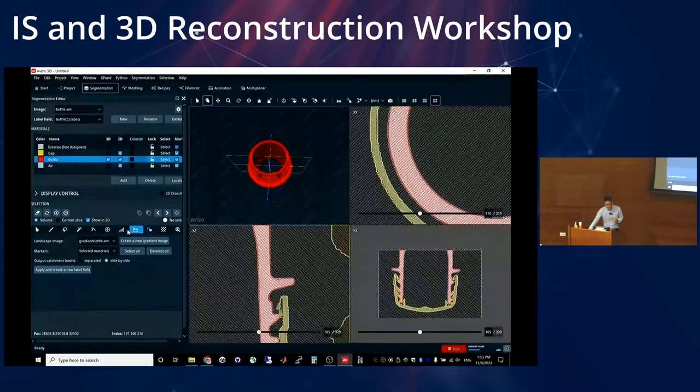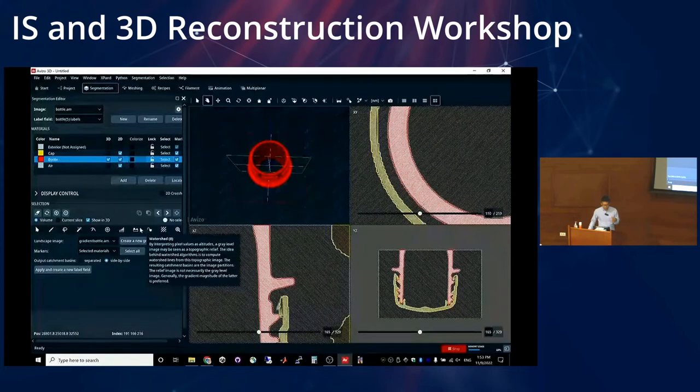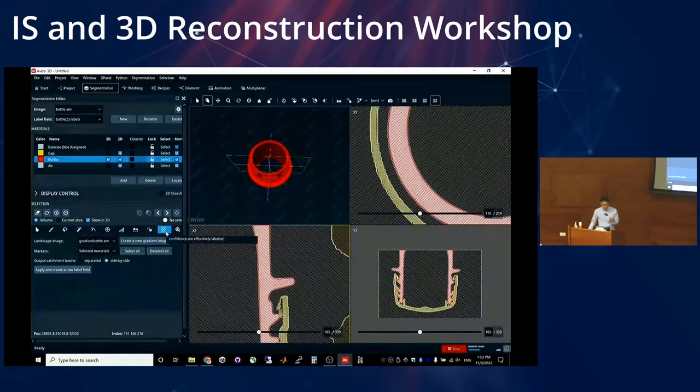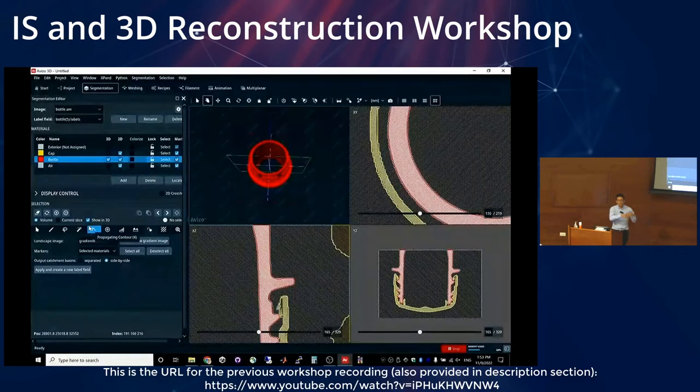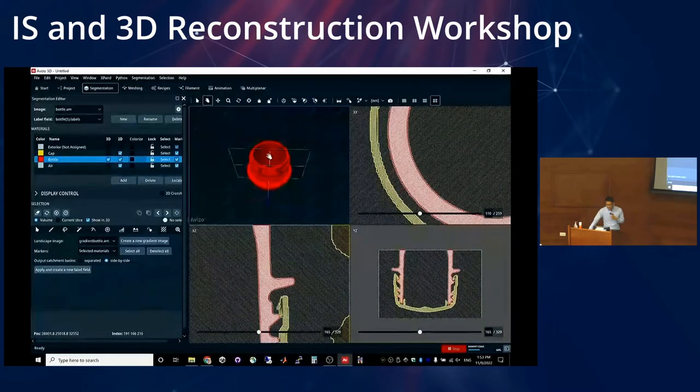You'll probably notice I'm introducing you slowly to the tools over here. There are different tools for segmentation. So far we've seen the brush, the threshold, and Watershed. I won't talk about everything, but later I'll talk about texture classification. If you're interested in the others, I did a video before that explains all of them, so you can look into those. You can just search for KAUST Visualization Core Lab on YouTube. We have a YouTube page. All right, anyway, that was the Watershed algorithm. I hope that made sense to you. Great algorithm.